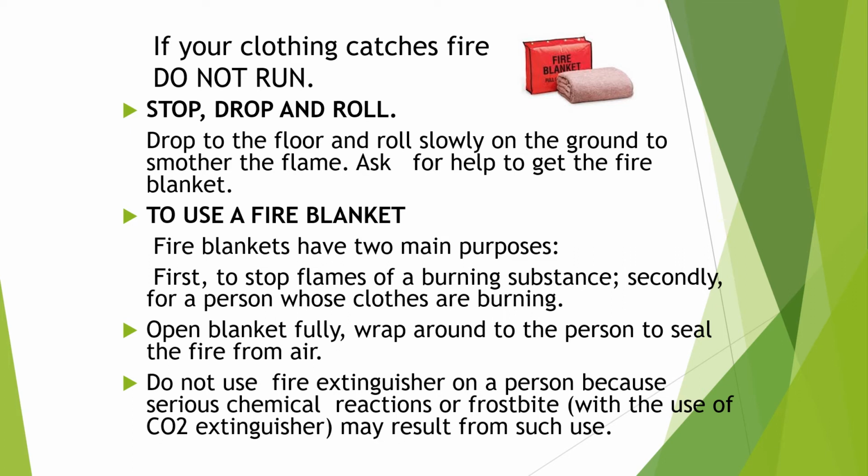If your clothing catches fire, do not run. What you need to do is stop, drop, and roll. Drop to the floor and roll slowly on the ground to smother the flame, and ask for help to get the fire blanket. Or assign someone in the station near the fire blanket to grab it as soon as there is an ongoing fire hazard.